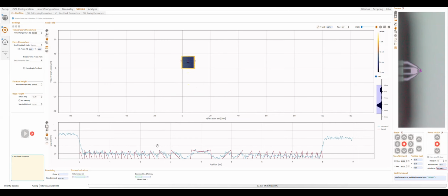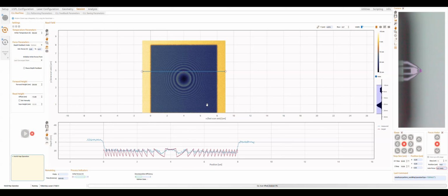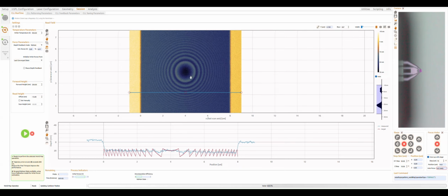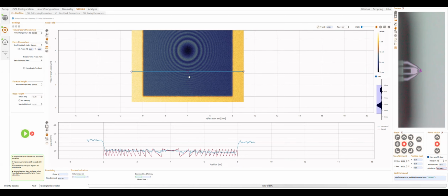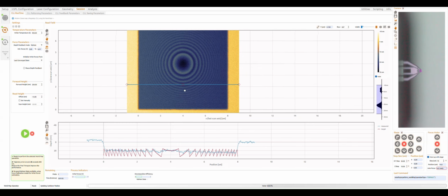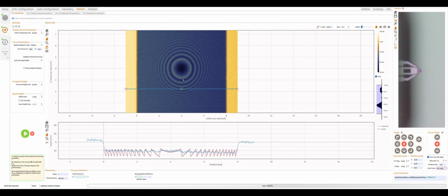Yes, so I will say, as these data are not what we would obtain realistically with the NanoFrazor, but still this is not that important. The patterning results are not what's important. The important thing is that you understand how to use the simulator and the software. So I will say that for this video we can close it here.